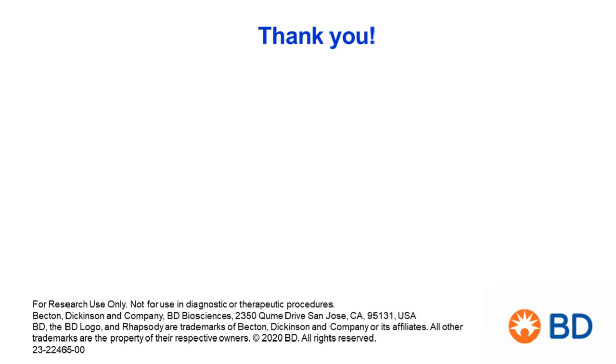Thank you. One of the questions is, if someone is looking at ways that they can use this technology, but they do not have a panel of antibodies, is there a way to modulate this technology and use it without antibodies? So I'm not sure if I understand the question about the antibodies for AbSeq technology, you mean?